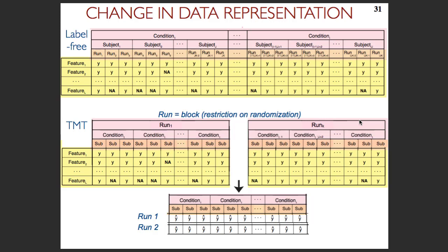Clearly, the interferences at the MS1 level are important, right? And this is something that happens at the experimental level. It doesn't really happen at the bioinformatics level. So this is part of how the data are. We can try to correct for that using some assumptions. And every time we do something with the data, we make assumptions, either we acknowledge this or not. Every time we take ratios or differences, we make assumptions. We just may not necessarily spell it out.